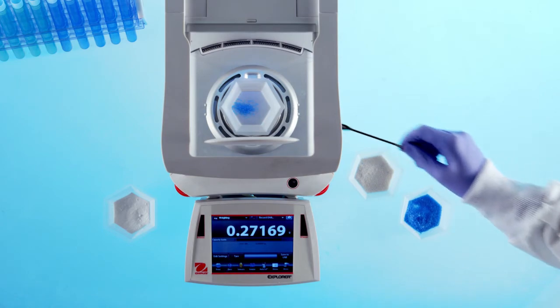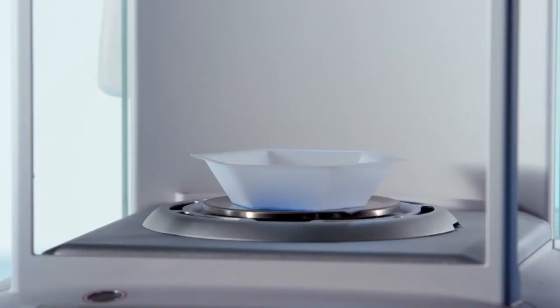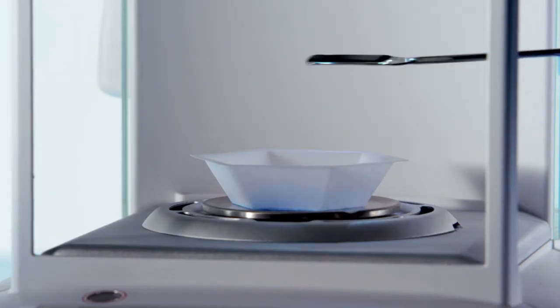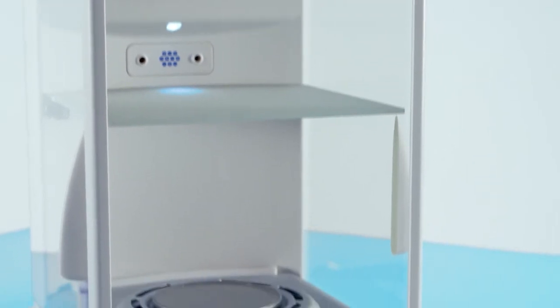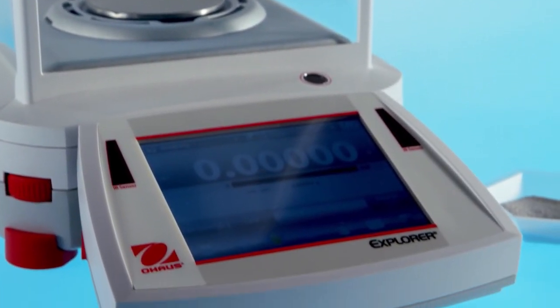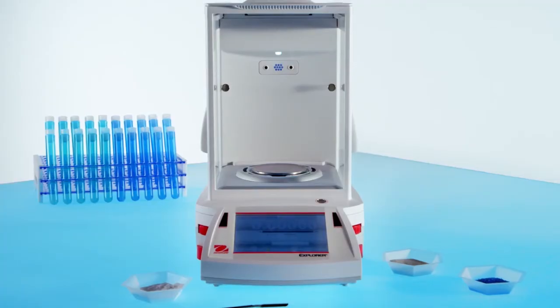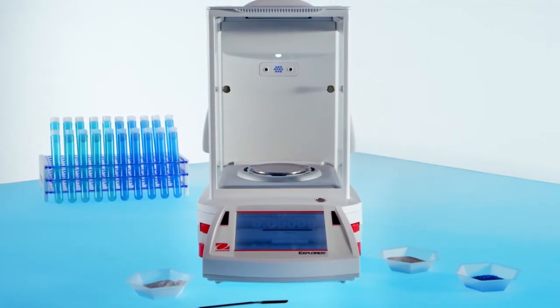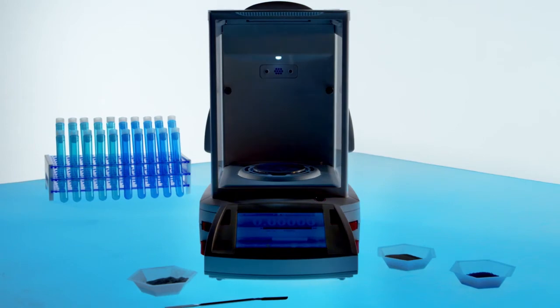O-House Explorer Semi-microbalances deliver the performance and features demanding lab professionals need. Intelligent performance, ingenious construction, intuitive software. O-House Explorer. Explore the possibilities for your lab today.